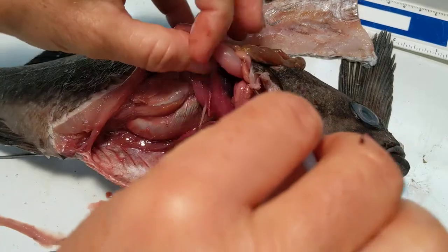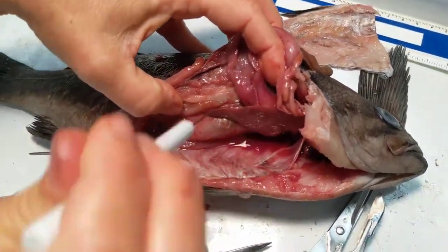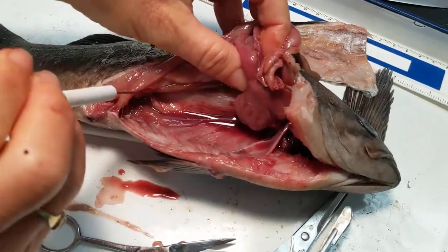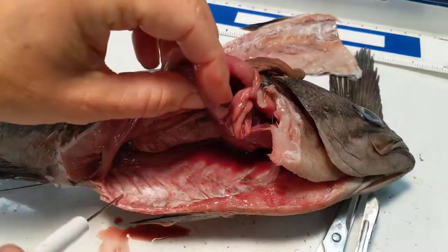And what else might we want to see? We can still see the swim bladder blown up. I think that's about it for now.